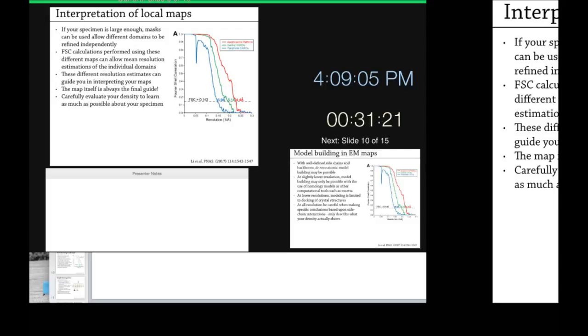because you know where all the helices are, you know where all the beta strands are, so you can fit secondary structure into them. But until you get to even higher resolution, sometimes it can be hard to see how they connect and thus register everything accurately. And this is a real issue in some maps, but people have been pretty careful, so there haven't been too many well-publicized mistakes made. And I think that continuing to use your density as the way that you interpret your map is the way to continue to avoid those problems from popping up.